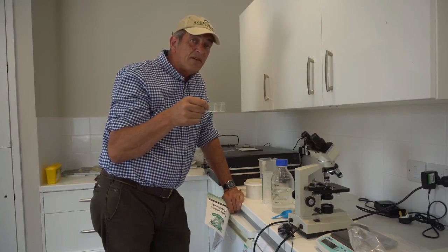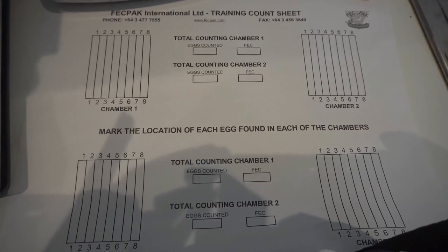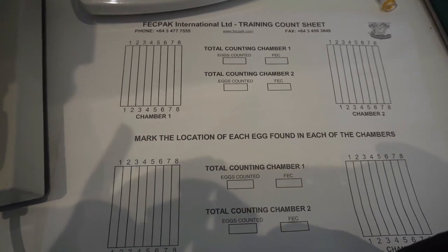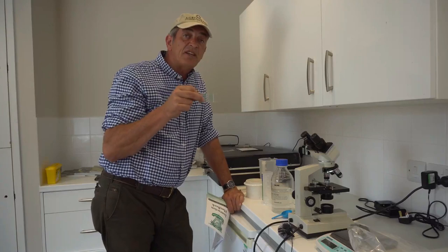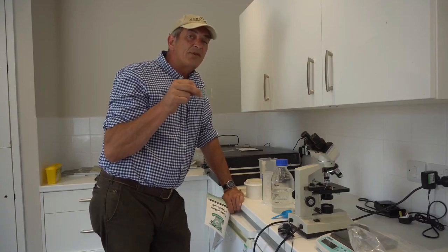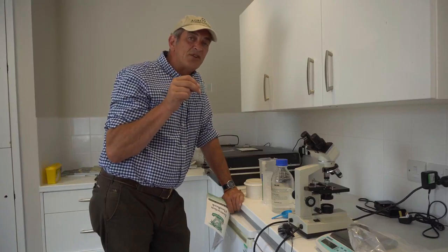You then look at a very simple graph which tells you exactly whether there are enough parasites to be burdening the sheep or affecting the thriftiness of its growth or its gut health. And then you have absolute evidence that your sheep require a drench.